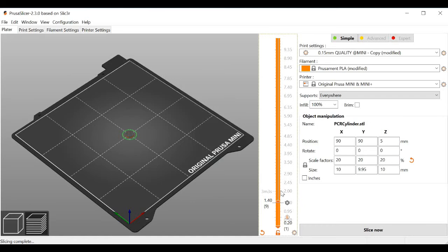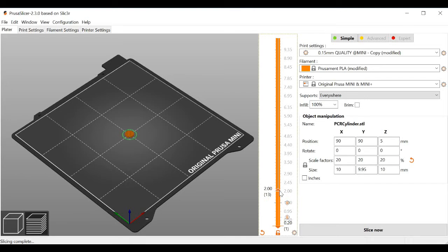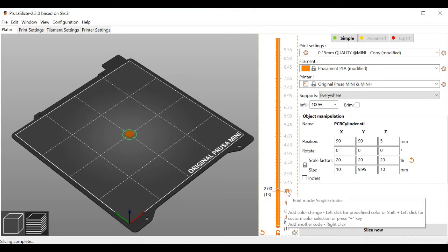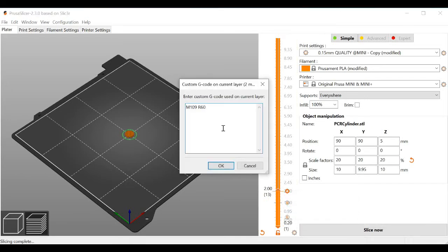Since this was a proof of concept, I only made one PCR cycle, but you can easily see how to repeat this multiple times to get a working PCR program. Obviously, if I wanted to turn this into a more useful feature, I would make it so that the program could easily change the temperatures and time parameters without having to manually edit each one individually.